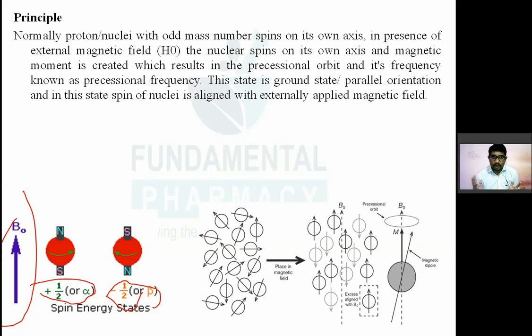Now at this time, if you pass a radio frequency wave, the nuclei will absorb this radio frequency wave and change their spin state.